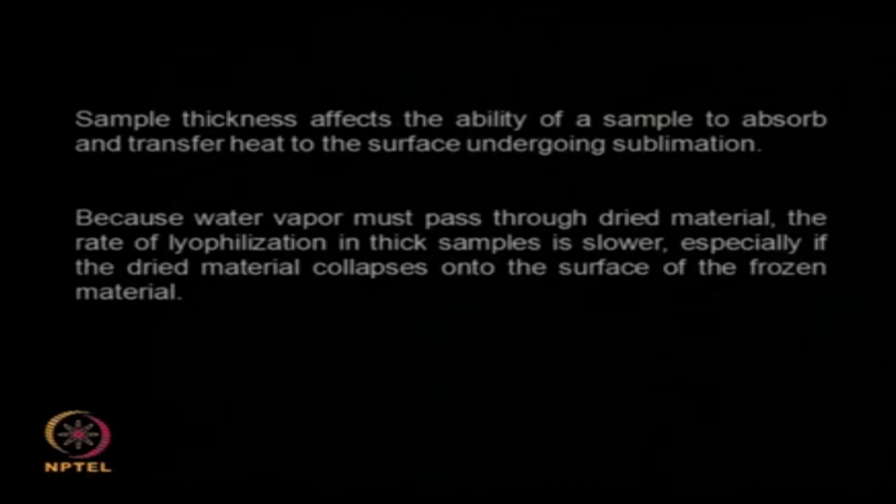Suppose the dried material forms a shell, and as it dries it may just collapse, thereby slowing down the diffusion of this vapor out into the vacuum region.